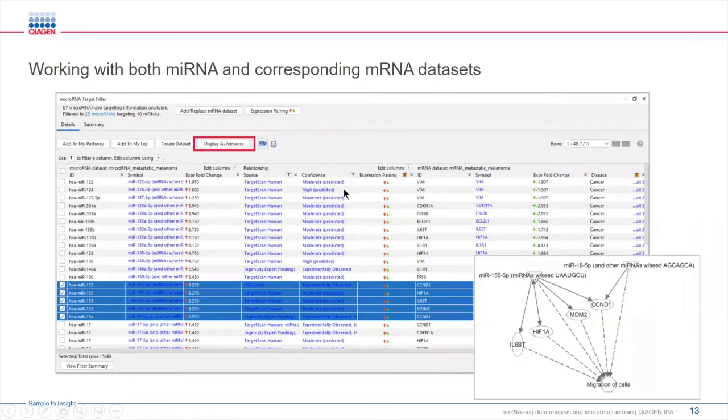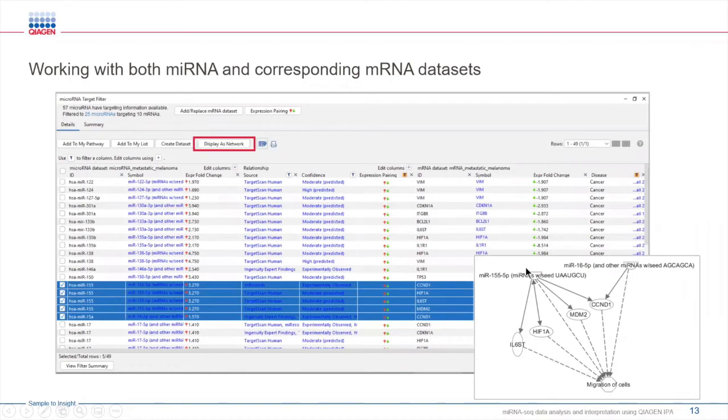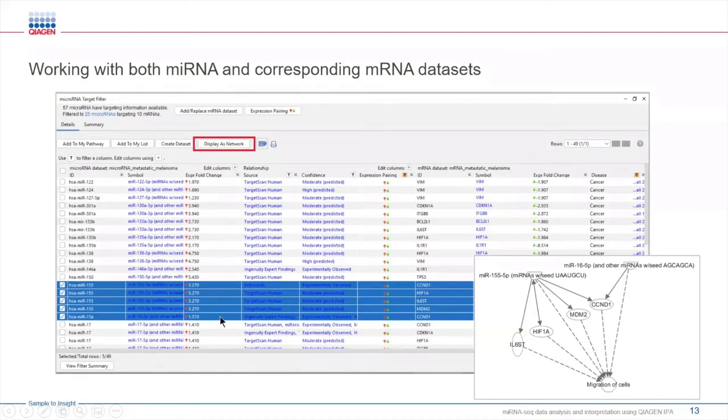Once you've narrowed down your target list, users like you begin to build a hypothesis and ask, how do these microRNAs and mRNAs interact? How do they affect downstream functions or diseases? In IPA, getting further information about these promising mRNAs and microRNAs is simple by displaying them as a network.